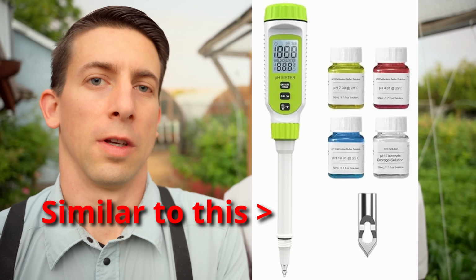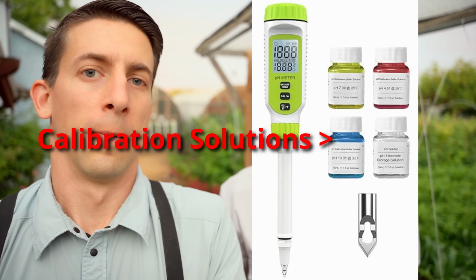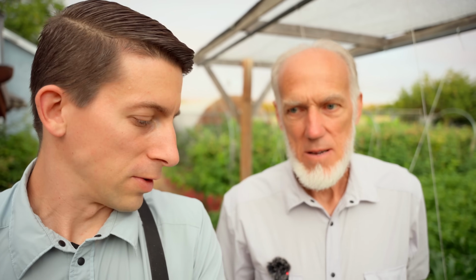Yeah. So I'm just going to tell you guys really quick, with this nice probe here, the better quality one, and even that cheap one that I was telling you about on Amazon, it uses the same principle of measurement, but you want the ones that come with calibration solutions. Usually it's like 3 different solutions, one at a pH of 4, a pH of 7, and a pH of 10. And then every so often you stick the probe into those solutions and hit a calibrate button on your tester, and it will calibrate your tester, because over time it might slowly change due to tip wear or probe wear. That's what you want to do.